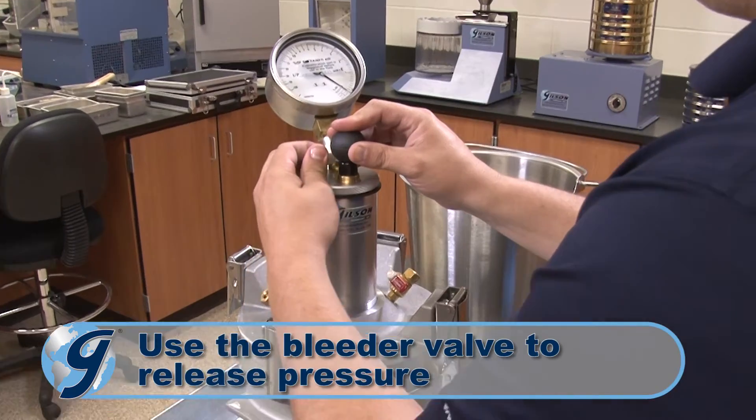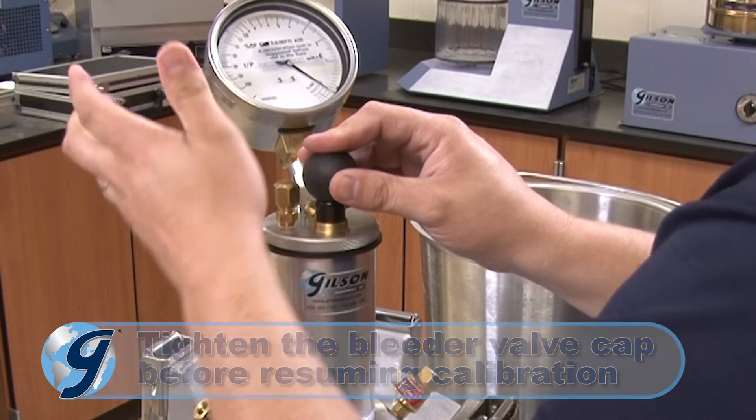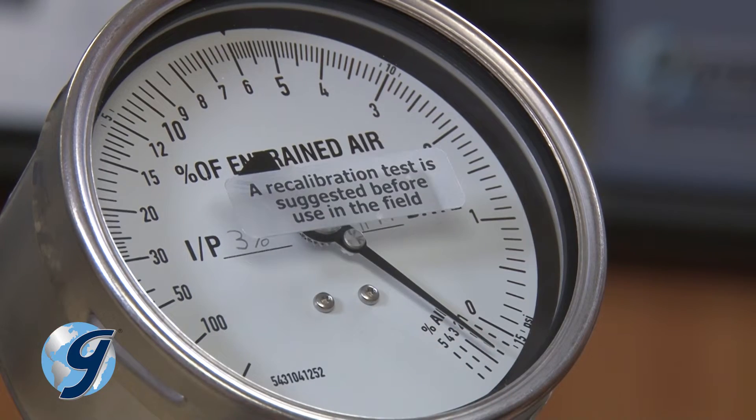And if too much air is pumped into the meter, loosen the air bleeder valve cap to reduce the pressure. Be sure to tighten the valve cap before resuming.